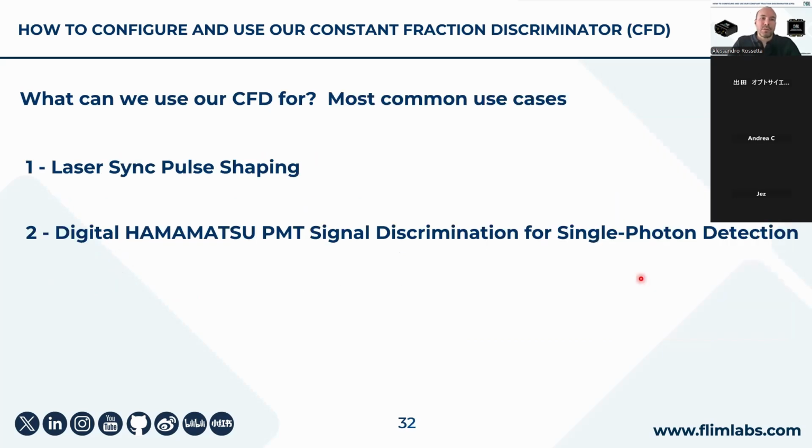Okay, so now what can we use the CFD for?